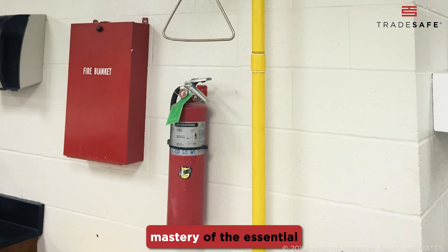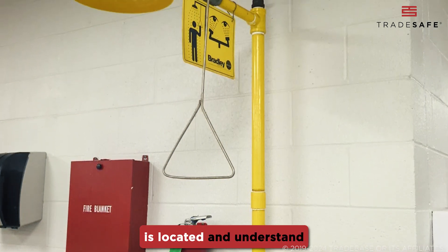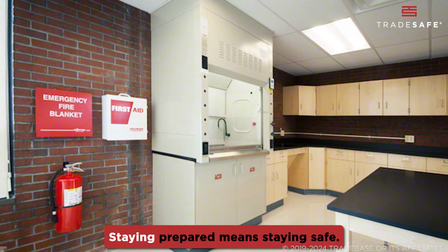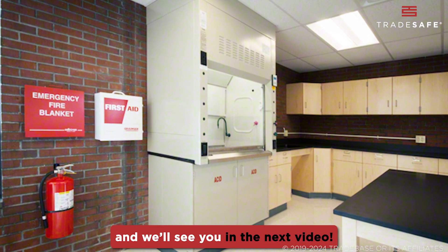And that's a wrap on our mastery of essential lab safety equipment. Remember to always know where your safety equipment is located and understand the correct usage of each piece. Staying prepared means staying safe.